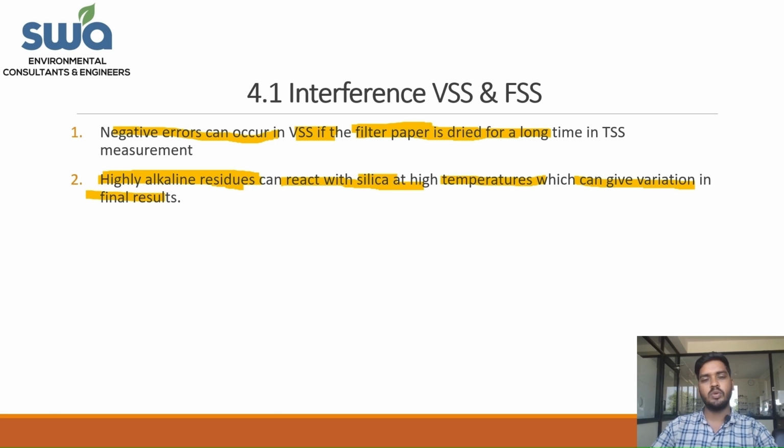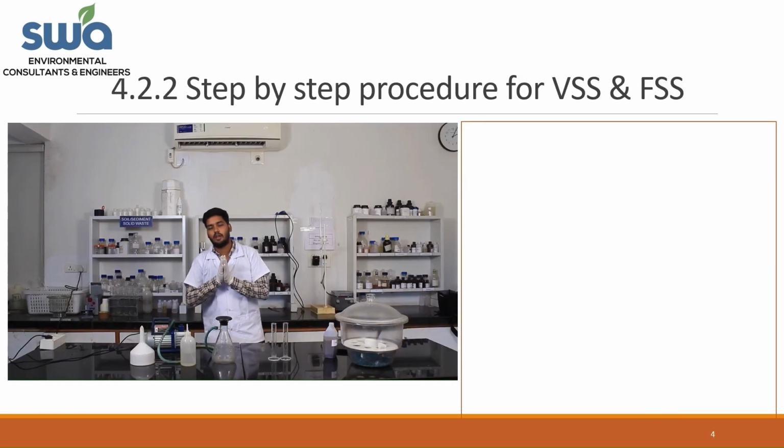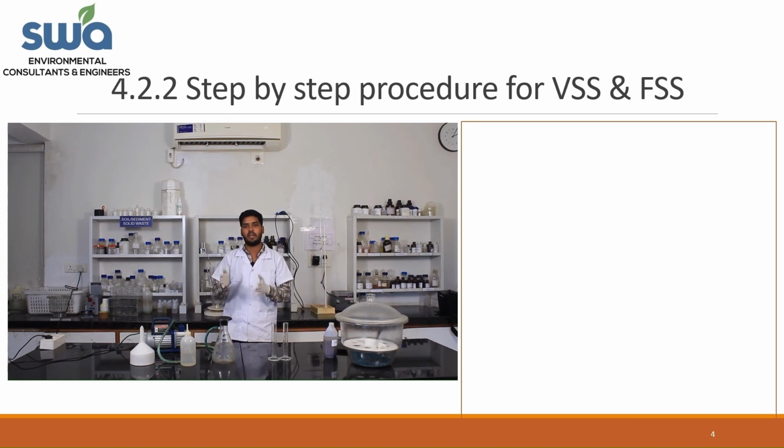Now let's move with the step-by-step procedure of measuring VSS and FSS. Now let's see the measurement of VSS and FSS in a given sample. So let's recall again the definition and principle of measuring the VSS and FSS.